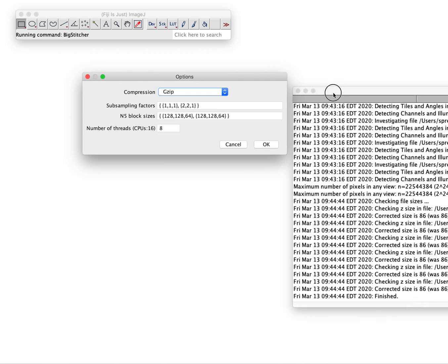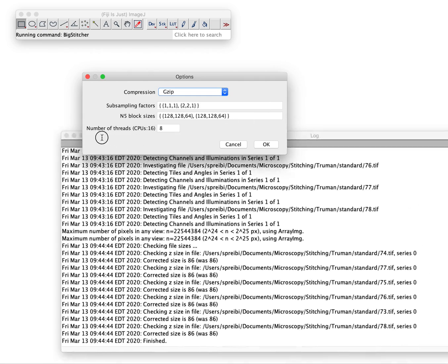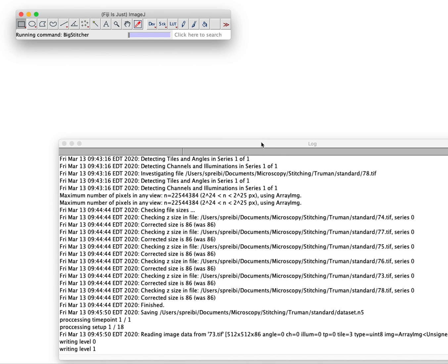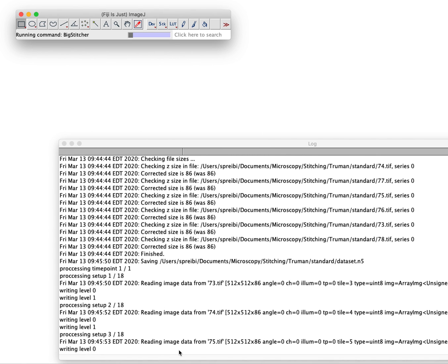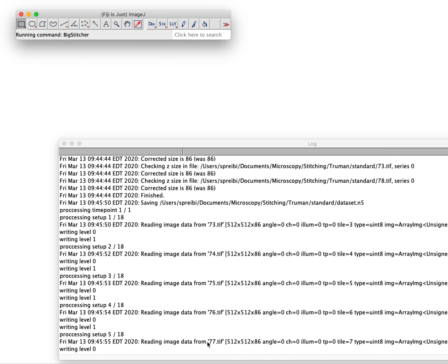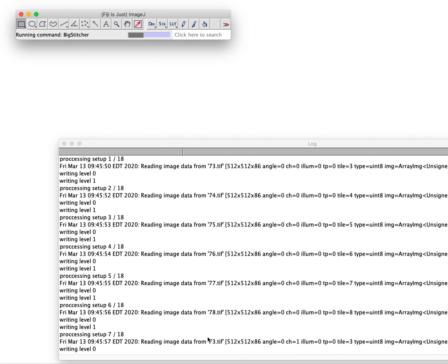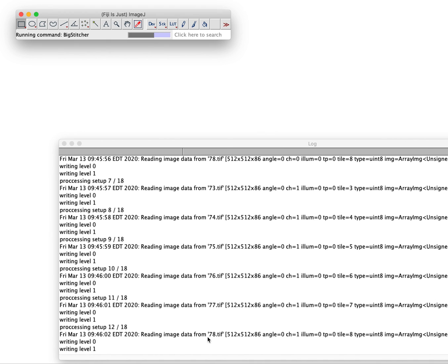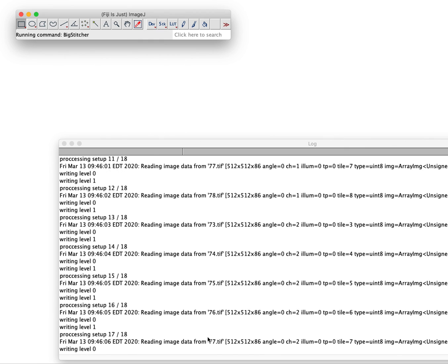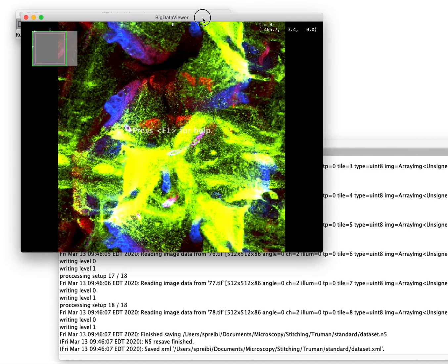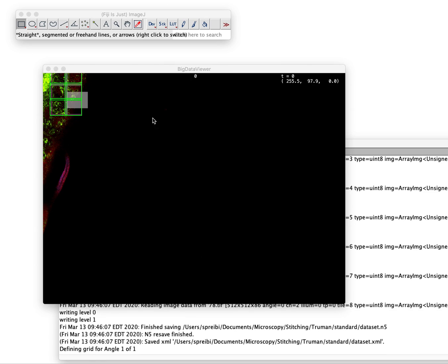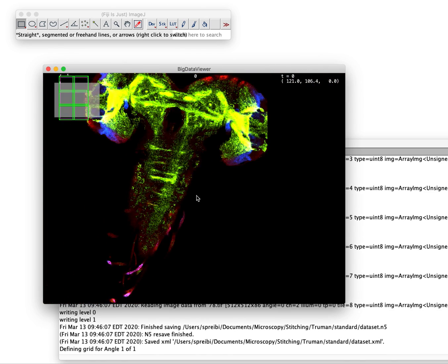I'll put this up here so we can see how fast this actually runs. Now we have 18 images, six images and three channels each, and it resaves them rather rapidly. Of course for large datasets this will still be slower. In the future I will show you how to do this on the cluster. That option I'm currently working on, it will be released soon. Now it has been resaved as N5.